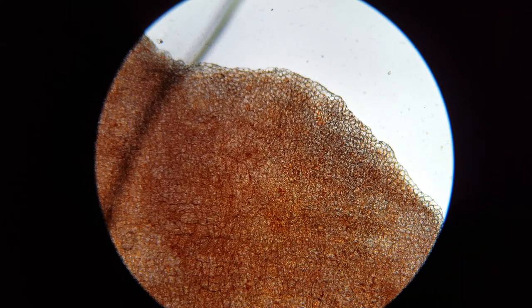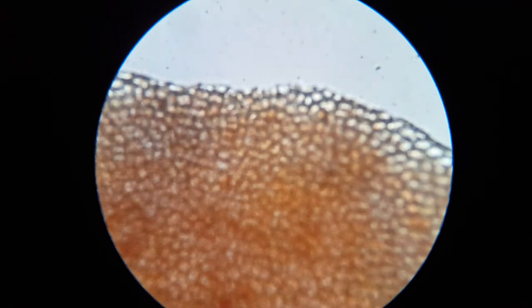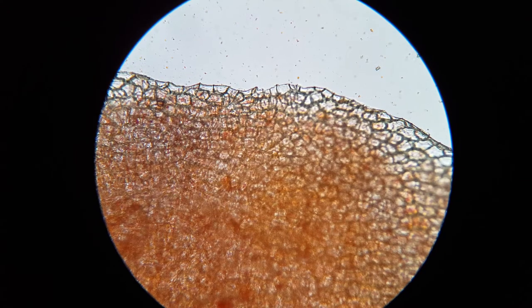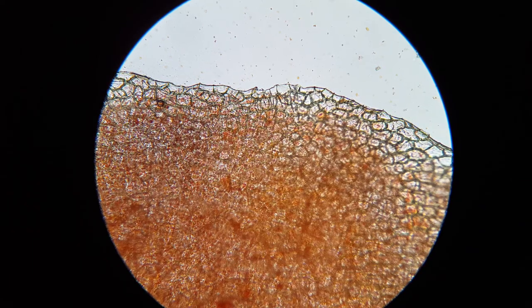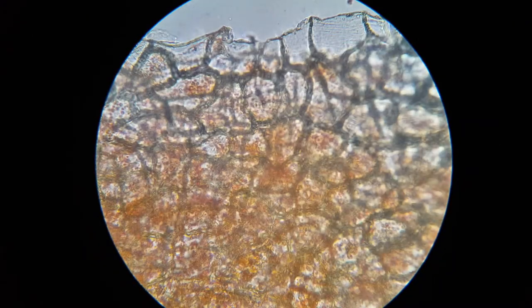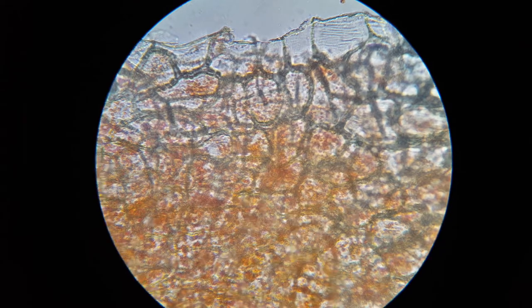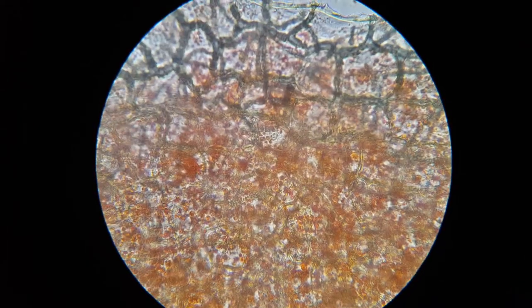Now we're looking at it using the 4x objective. I used the coarse focus to get it there, switching over to the 10x objective. So now we're looking at a 100x magnification. You'll notice that I've attempted to look especially on the edge of this thing. Now we're switching over to the 40x objective. I'm looking at the edge of the skin — I'm assuming that at the edge is where I'm most likely to see individual cells.